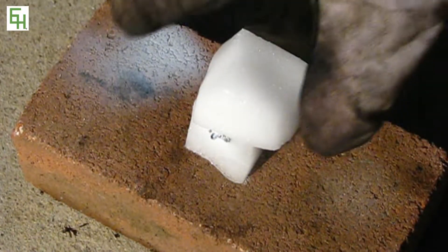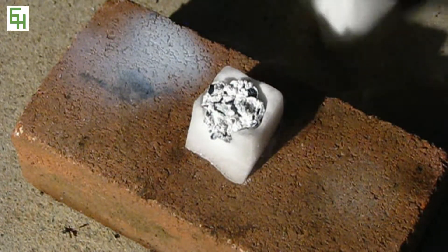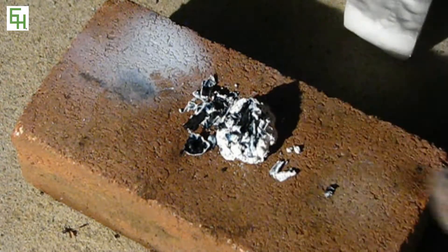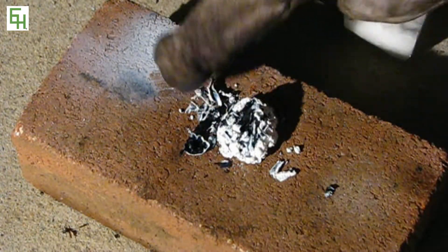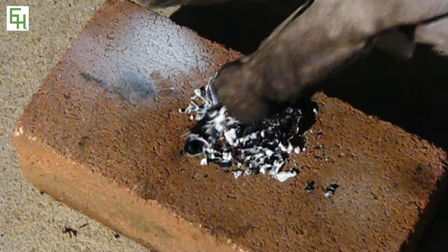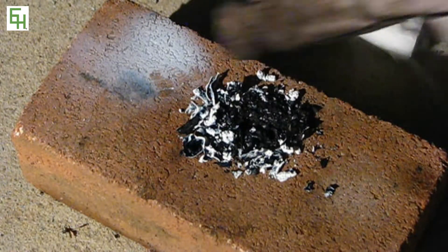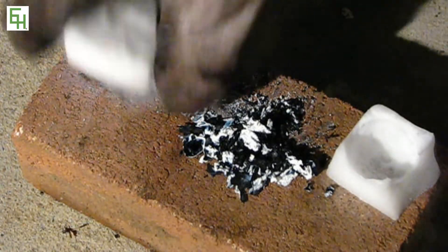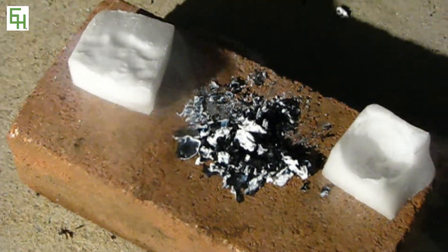Let's see what's inside. Here we see that we have tons of this white powder, lots of black powder too. So the black powder is carbon, and the white powder is magnesium oxide. That's what you get when we combine these two together.